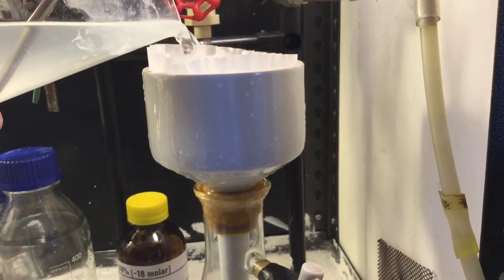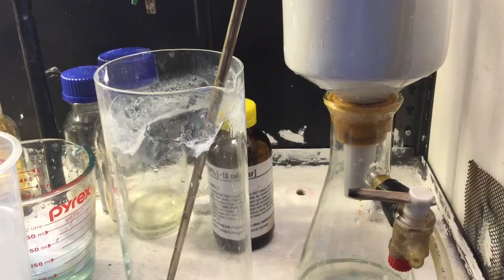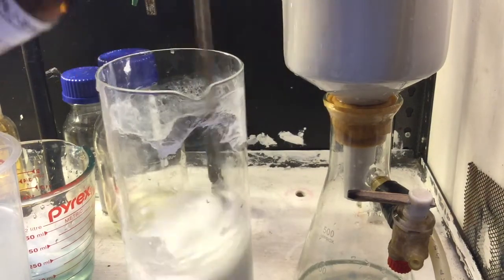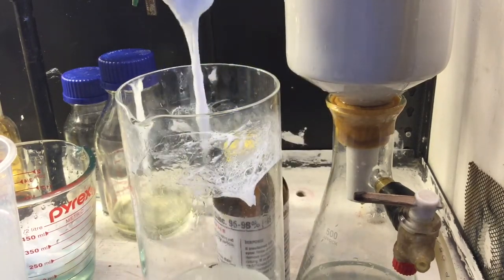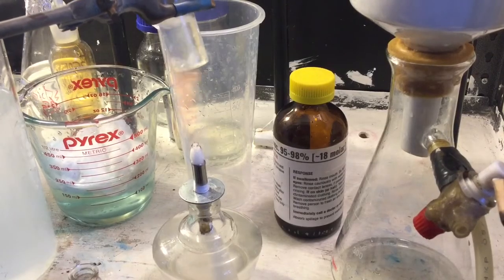I still have some leftover, so I process that as well — just pour it into the beaker, add sulfuric acid, stir until it gels up, and pull out the gel. It's quite simple. Now we're going to filter it.